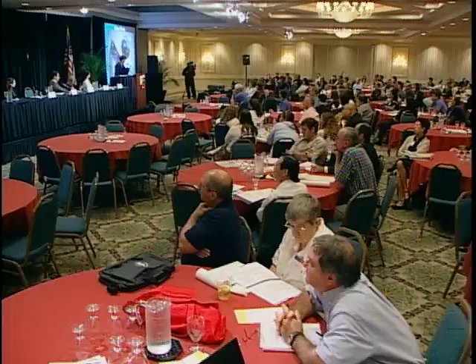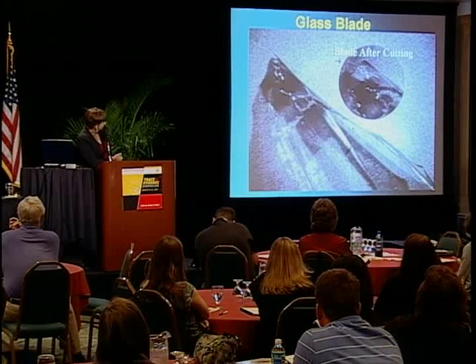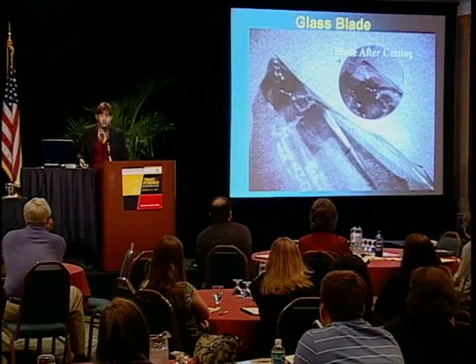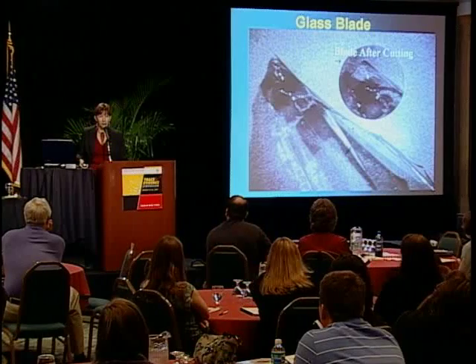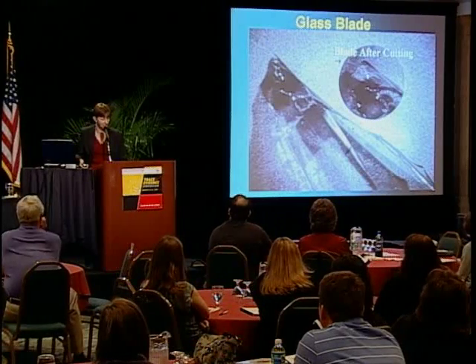You might think that the whole edge of the glass is going to be doing the cutting, but it turned out that when this glass was doing the cutting, it was really just the very, very fine tip of the glass right here that disappeared as the cut was being made, which helps explain why these cuts are so sharp. We are dealing with very thin blades, very, very fine blades, razor sharp.